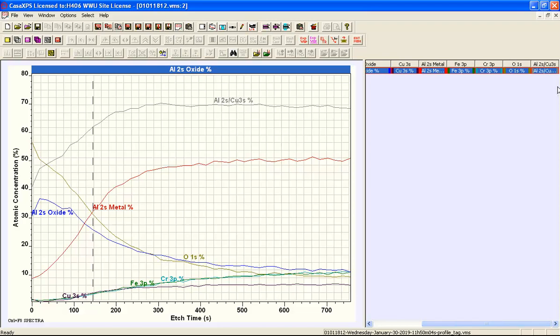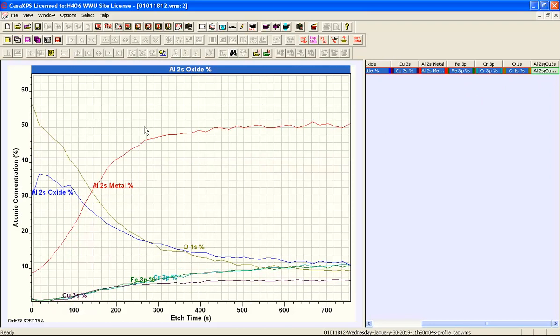We need to remove the combined region from this profile. We now have a depth profile constructed from a set of regions from the survey spectrum — such as oxygen, iron 3p, and chromium 3p — along with traces for aluminium oxide, aluminium metal, and copper coming from the high-resolution proportion applied to the intensity as measured by the survey spectrum using the effective RSF.